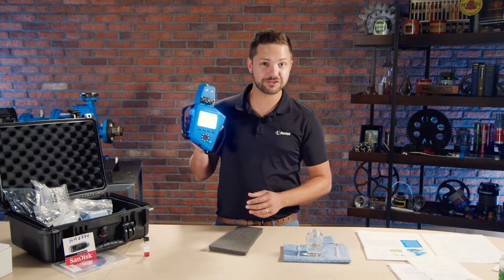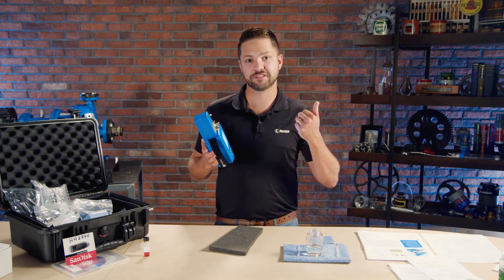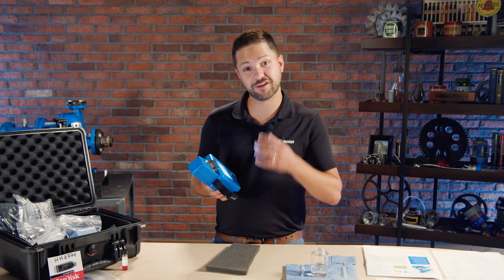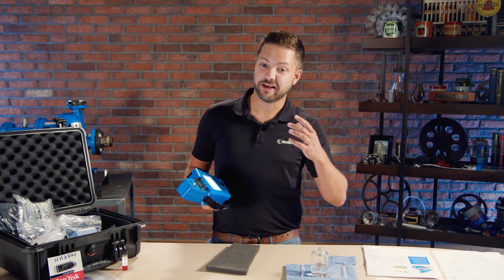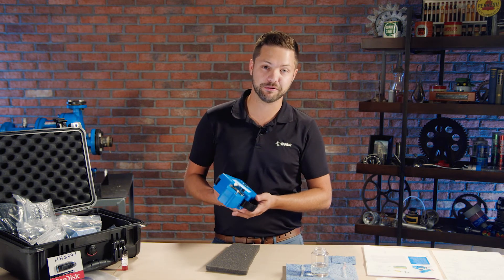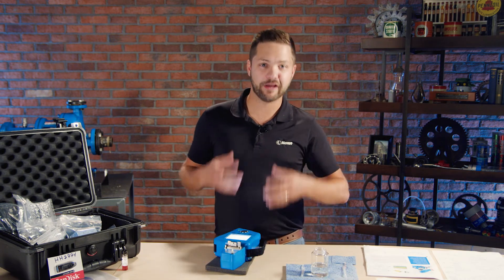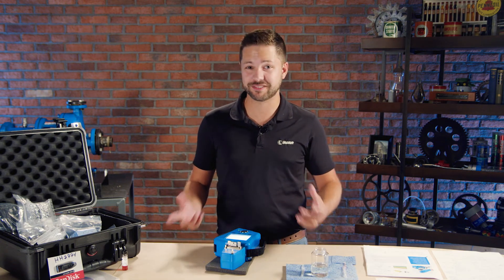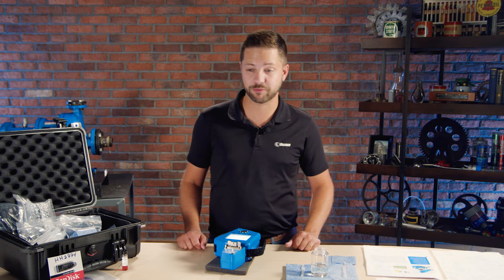This is the industrial version — there's also a military version and a marine version as well. Spectro has really great customer service, and when you buy the 1100, that's an opportunity to have a field engineer sent to your plant to help you get set up and go through a little training. But in reality it's not always necessary — you can learn things pretty quickly with what you have here.